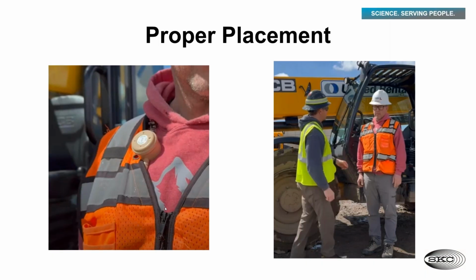As soon as it snags and they keep on walking, it's going to very quickly eject that cyclone or PPI or whatever it is off their person and fling it upside down into the wall, into the ground, or whatever it might be. So making sure that the Tygon tubing is completely secured inside either their vest, a shirt, whatever it might be, is going to be a huge plus for them, and it's going to make sure that you get a viable sample.